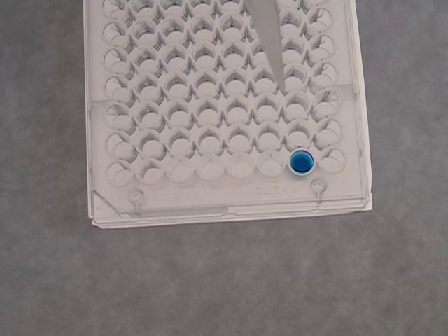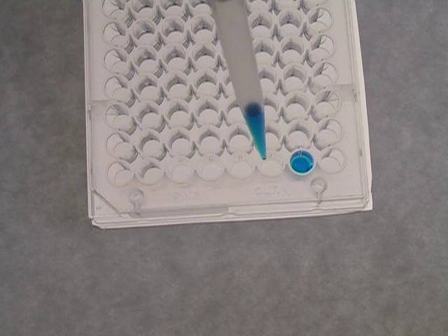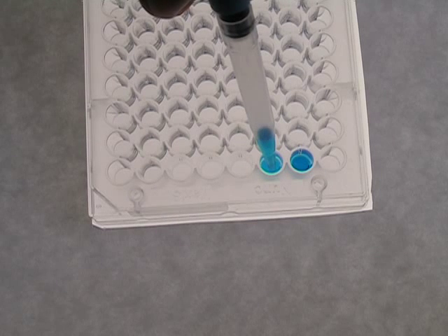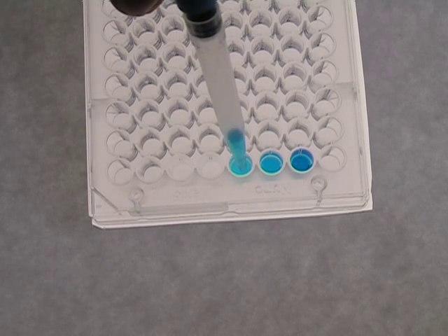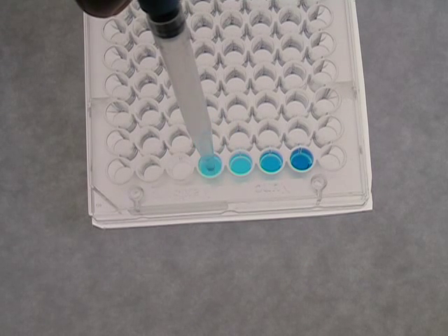Next, 500μL of stock is taken and mixed with the diluent of the next well to create a diluted solution that is then used in turn to create the next dilution. This process continues until the last dilution has been made, where 500μL is discarded to ensure that each dilution has the same total volume.